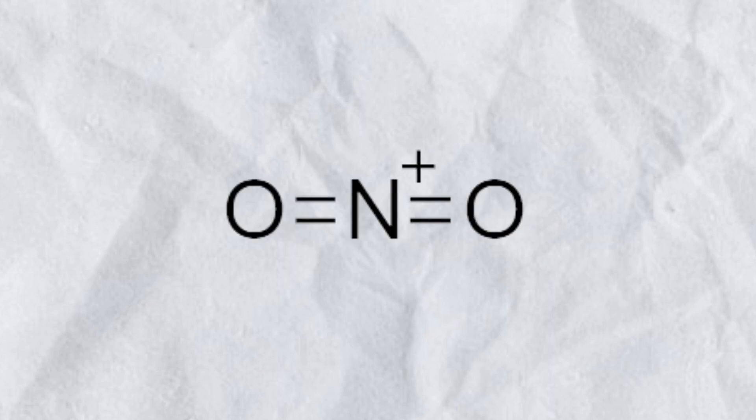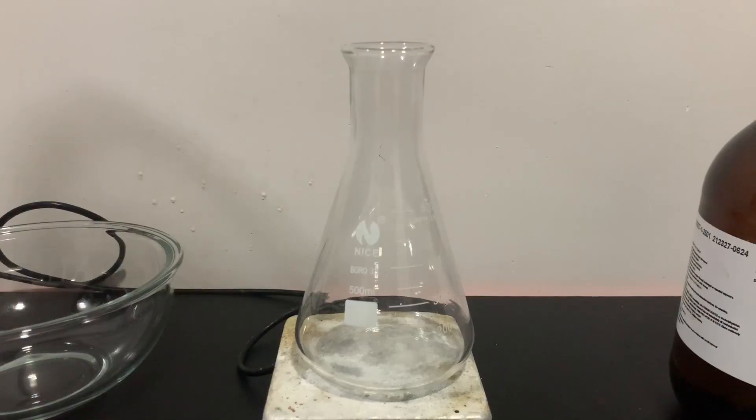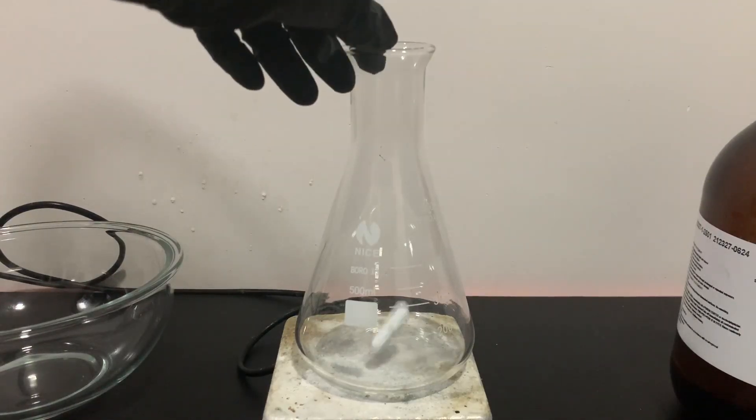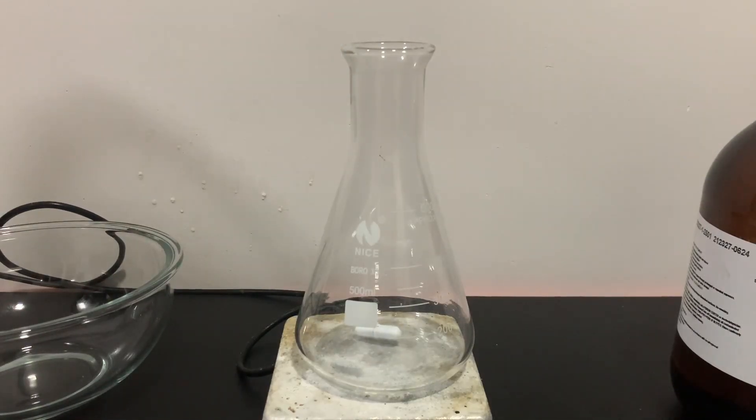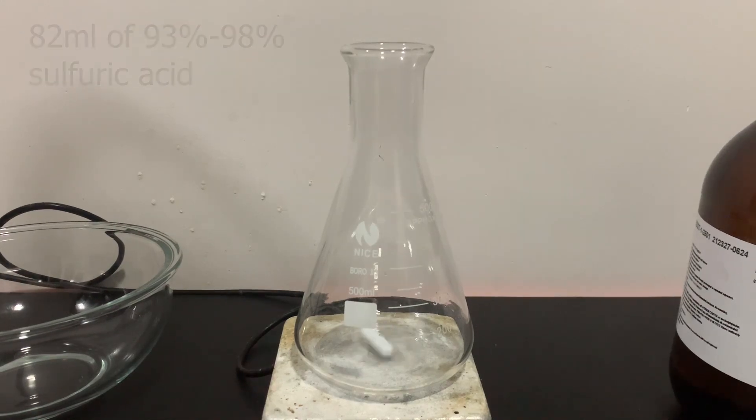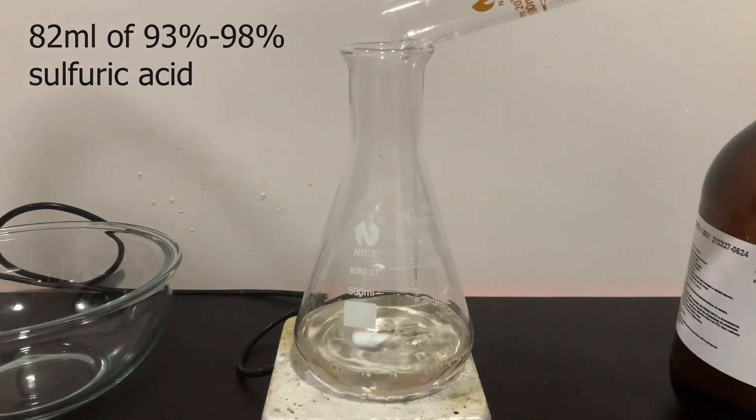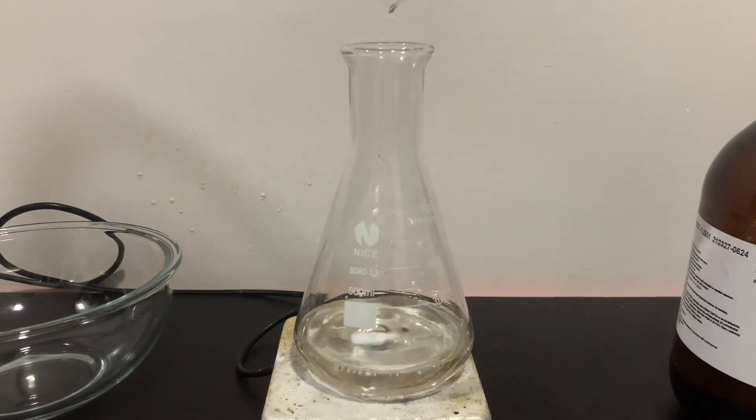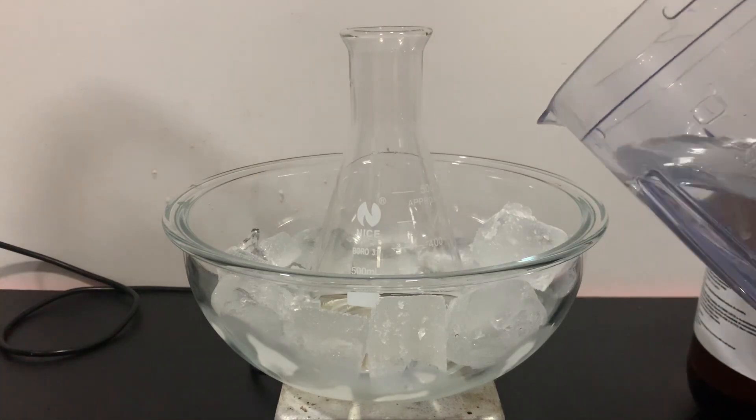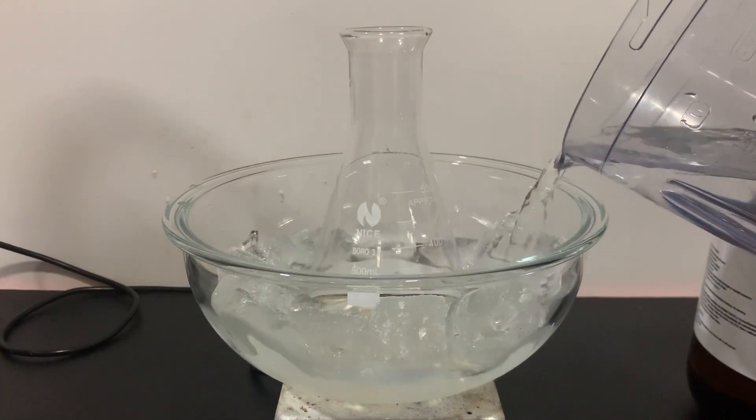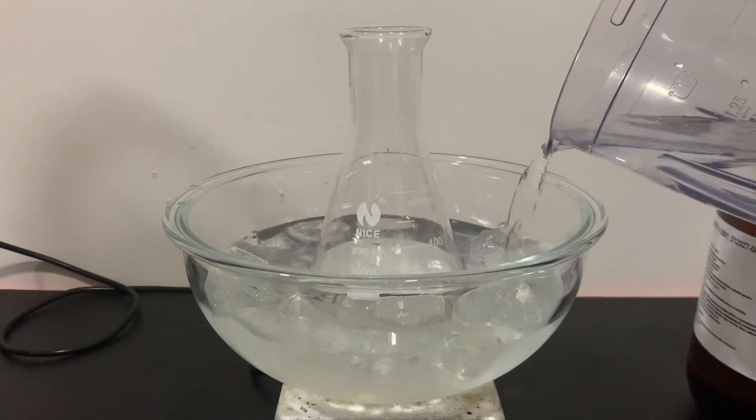To make the nitrobenzene, we are going to have to firstly form the nitronium ion. This was easily done by adding 82ml of concentrated sulfuric acid into a 500ml flask. The flask is then cooled with an ice bath as the next addition will be highly exothermic.